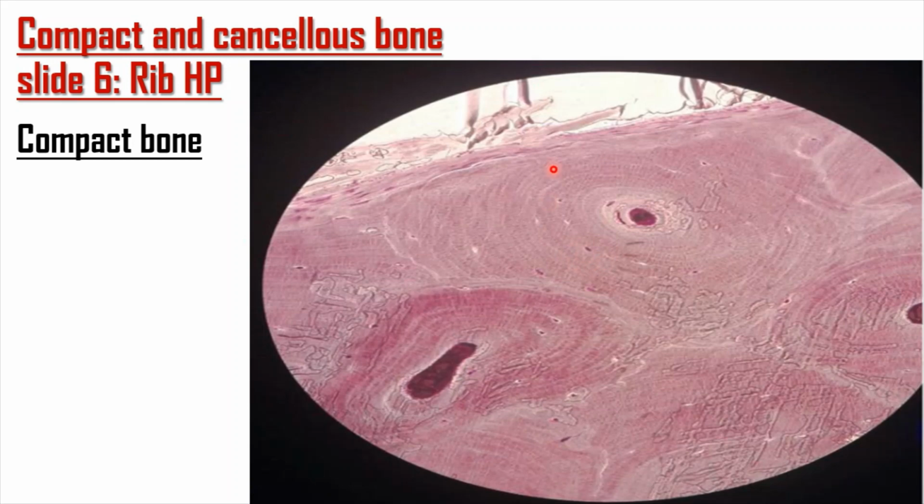So what you find in the lamellae is lacunae. The lacunae are the spaces which contain cells known as osteocytes. So this is the high power Haversian system. Draw the central canal here, and then you show the lamellae, and then in the lamellae you show the lacunae. Inside the lacunae, you then show the osteocytes. If this diagram is not very clear for you, I have put another diagram here so that you can see it.